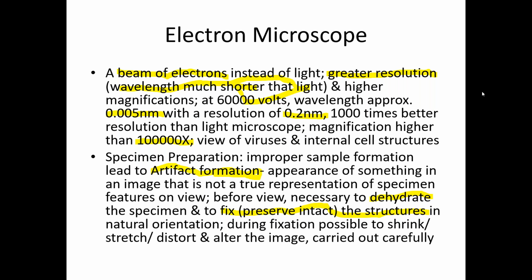In electron microscopy, we are going for dehydration. There is a special technique for that. I will explain in the next slide. What is the way by which we are going for dehydration? I will explain in the next slide.